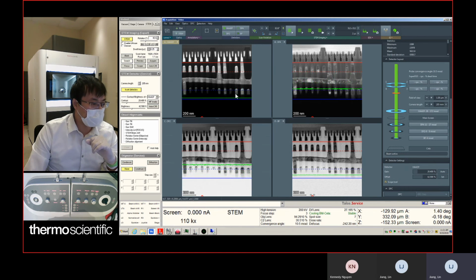By using the scope tool, you see the curves, and you can give a little bit more contrast. This is too much contrast, so we can decrease it a little bit to make sure this green line is below the red dash line and above the blue dash line.